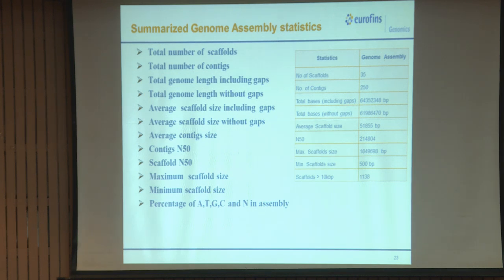Yeah, so, we can use the paired end reads to identify in silico what the approximate size is. So, once we are approaching that size with gaps, we see how much it is without gaps. From here we can see how good my assembly is. If I am ending up with 50 MB and only 4 MB is bases and the rest is all Ns, that means a huge difference. So, that cannot be an assembly, that cannot be a draft assembly. It should be the opposite way.